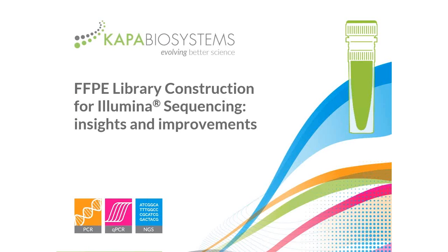Thank you very much, Andrea, for the introduction, and thank you everyone for taking the time to attend our webinar today. So as you know, KAPA Biosystems has been involved in developing enzymes and kits, especially for sample preparation for Illumina sequencing, for a number of years. And we've been very focused on FFPE as it's becoming a more and more important sample type in both research and clinical applications. And so hopefully in today's seminar we can provide some insights on library construction from FFPE DNA and also talk about the improvements that we've made to some of our kits for these applications.